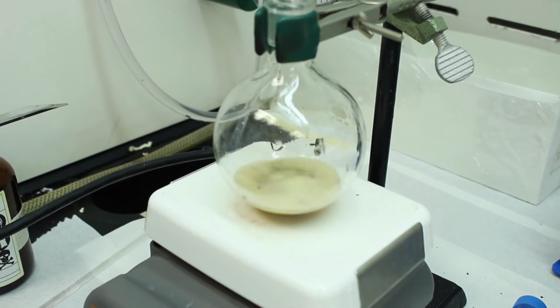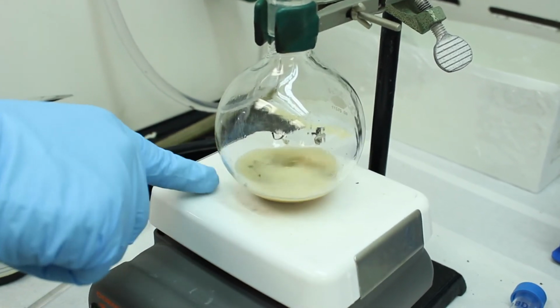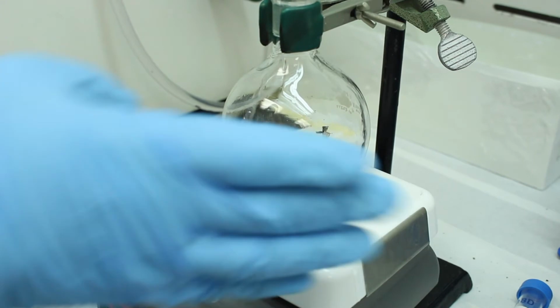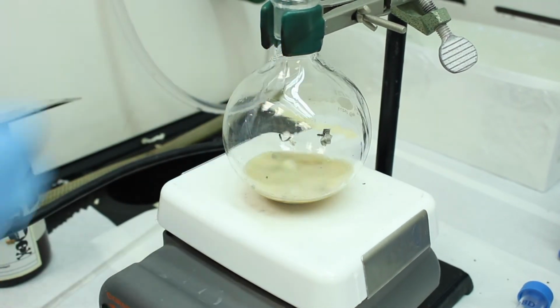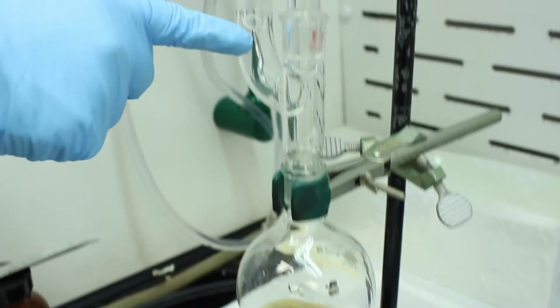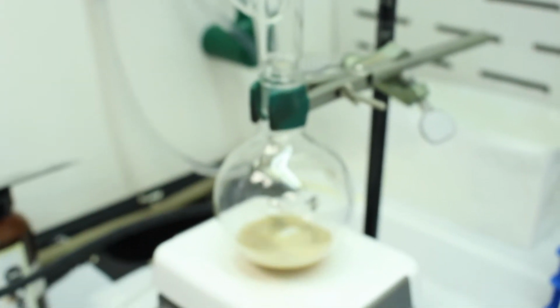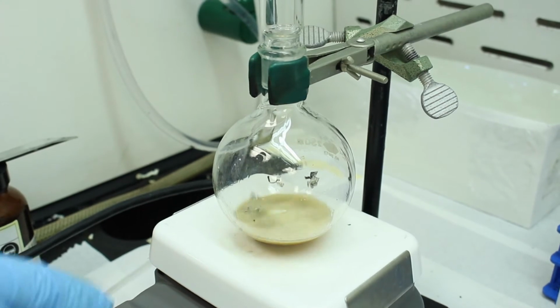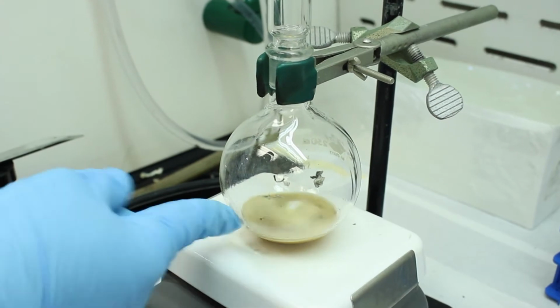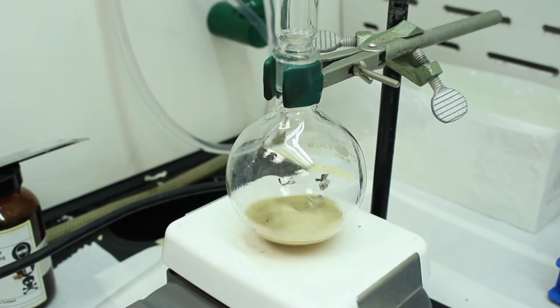So we're just going to keep this going. It's going to take maybe 10 or 15 minutes. At the end of it, most of the magnesium will be consumed. There will be a few pieces of magnesium left over, but for the most part it will stop fizzing and most of the magnesium will be gone. You can see the condenser now recondensing some of the ether. So you might even want to taper the drip rate here. If you overheat it, so say you add too much bromobenzene or you heat it too much with the hot plate, the ether might make its way out at excessive rates, so you'll lose all your solvent. You don't want to do that. So this is not a very high efficiency condenser.